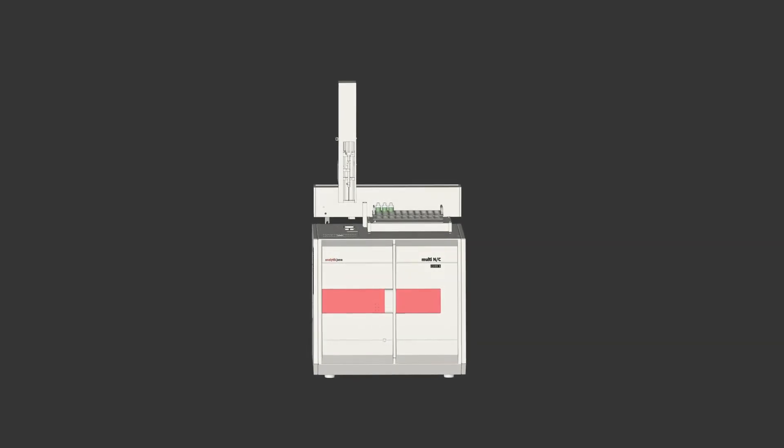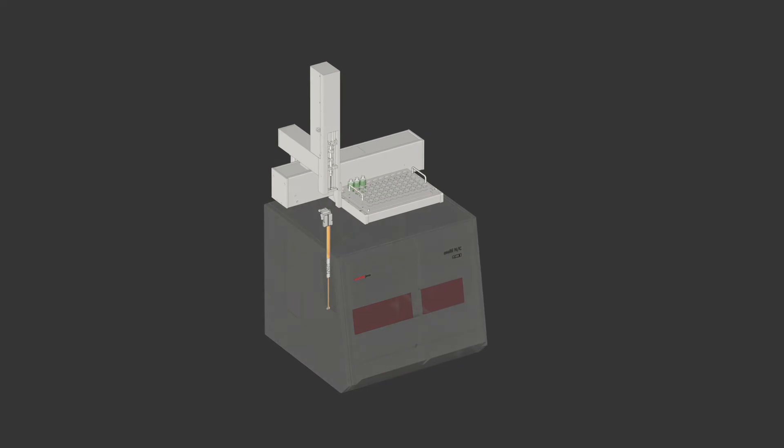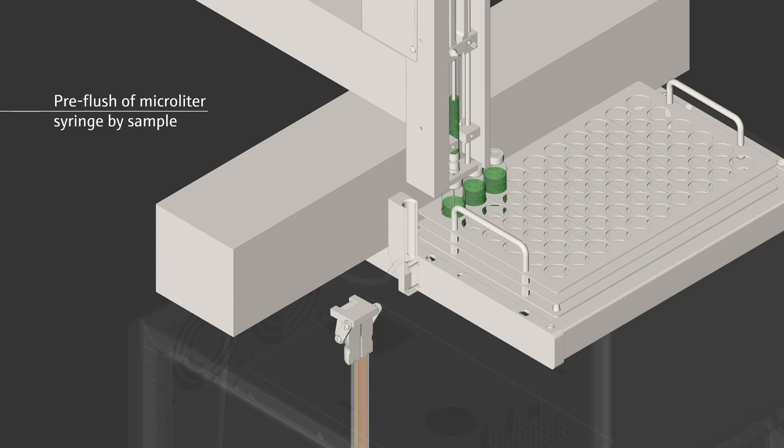When dealing with heavy particle loaded or oily samples, Analytic Jena's direct injection technique is the solution of choice. The sample is directly taken up into the microliter syringe, with a rinsing step included.